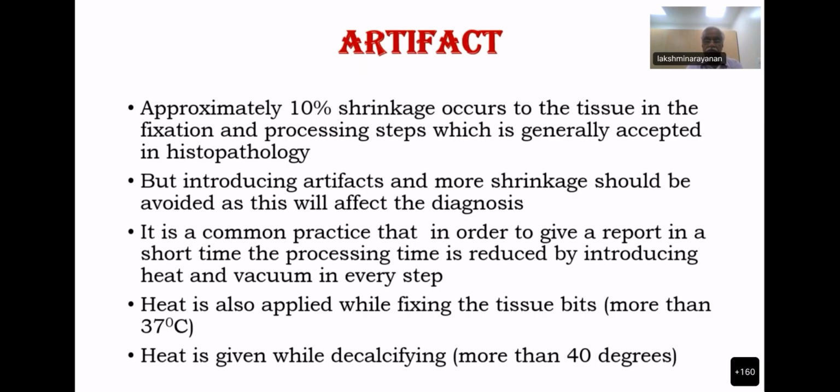The point is, for testing purpose, they would have done it. They would have done, but we don't know who has done it for 10 years. Nobody has done it because the machine has come to the market very late. So we have to try and then study whether the immunos also work on that, and how much shrinkage is there for the tumor nuclei. All these things we have to study. Just because the company people say that heat is there, you can give and you can finish the process in 2 hours time, we cannot blindly follow it. That is what I want to stress there.